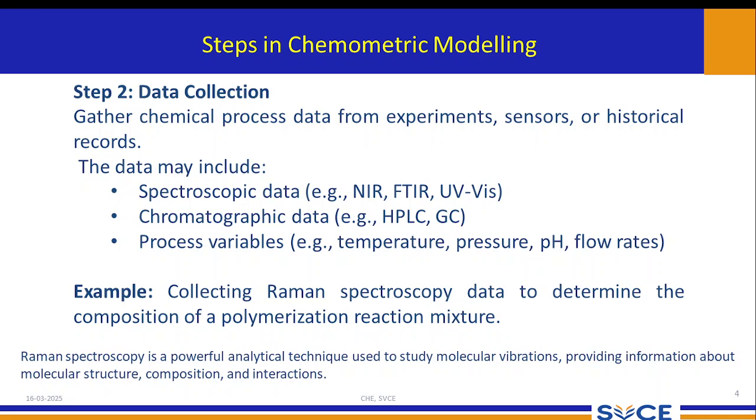For example, collecting Raman spectroscopy data to determine the composition of a polymerization reaction mixture. Let's imagine a polymerization reaction is carried out in a CSTR. I want to collect the Raman spectroscopy data.